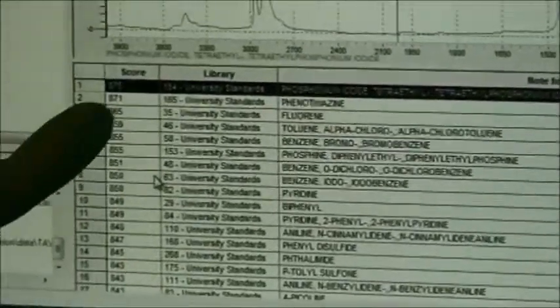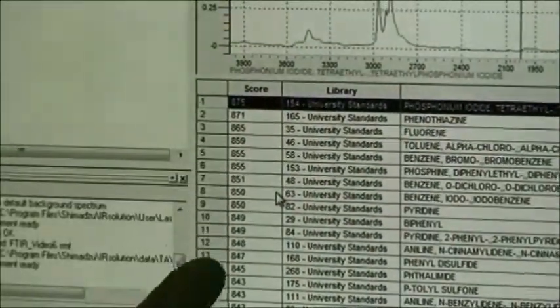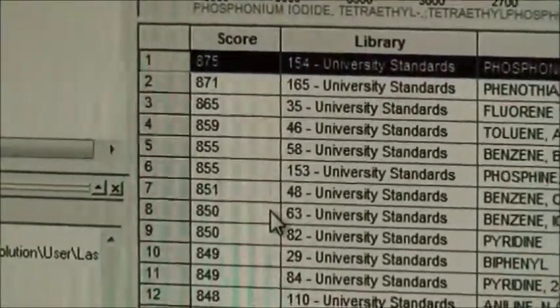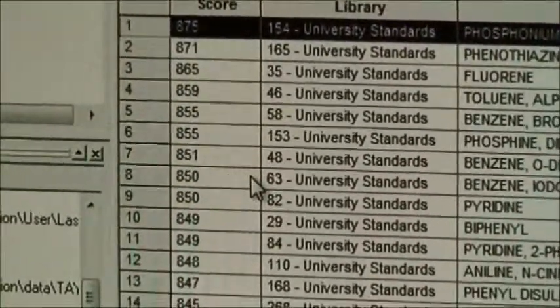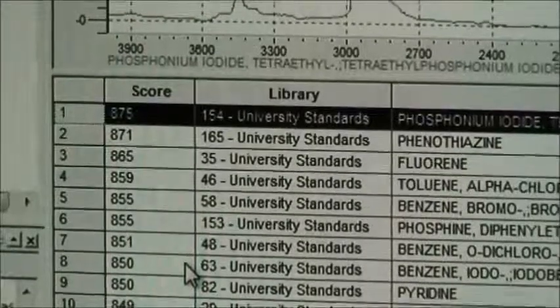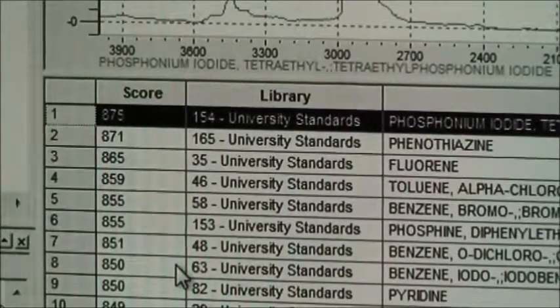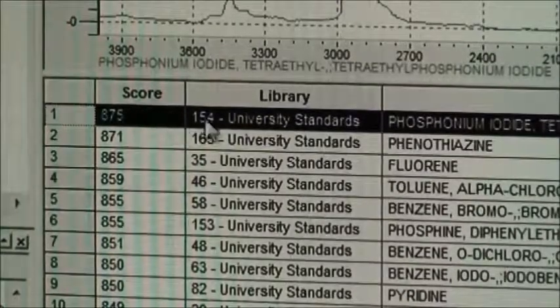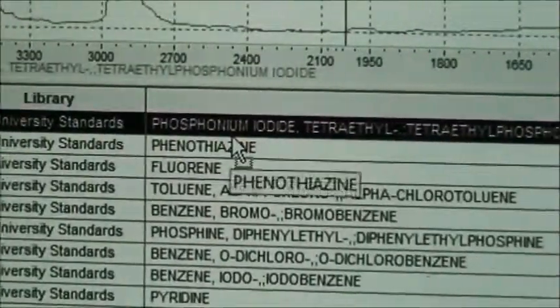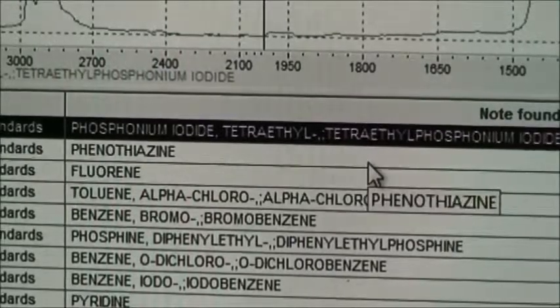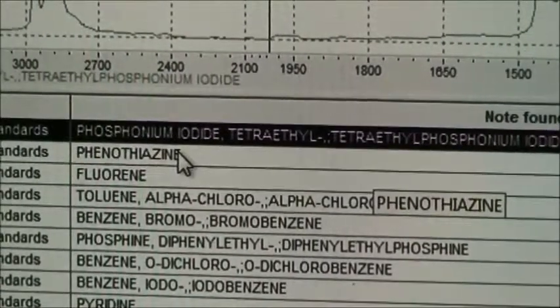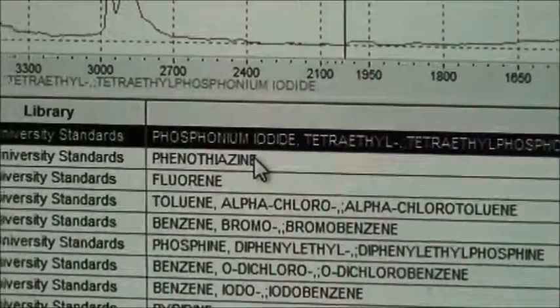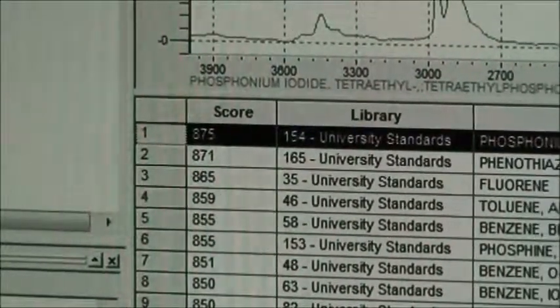The score is out of a, if you check here, it gives you all the different spectra that it's related to. And the score is out of 1,000, 1,000 being the highest. So it says the closest one it sees is barium iodide. And it's 875 out of 1,000. That's not really good. And we know just because of what we put in that this is not it.